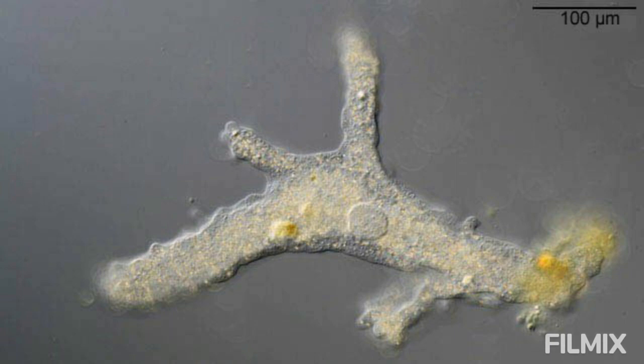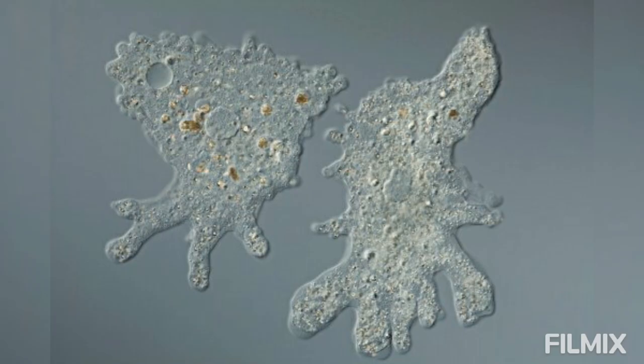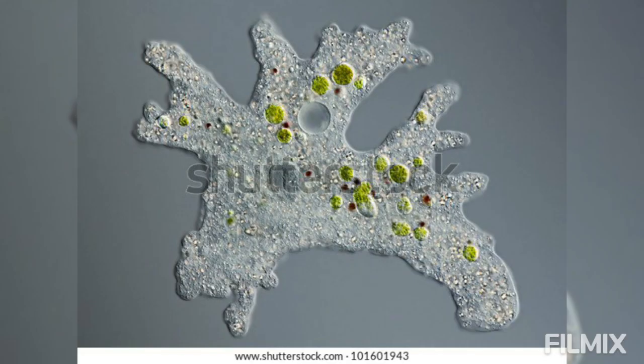To prepare the culture medium, tap water should not be used because it is usually chlorinated. After boiling for about 15 minutes, the water is filtered and the filtrate is allowed to cool.